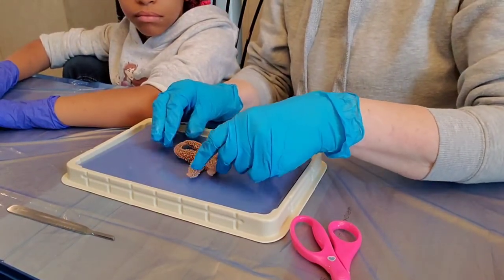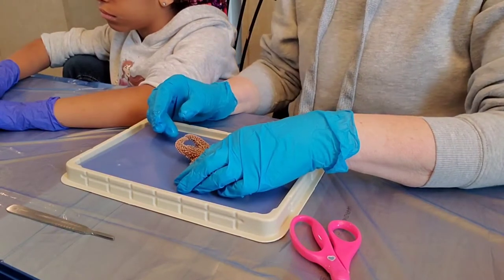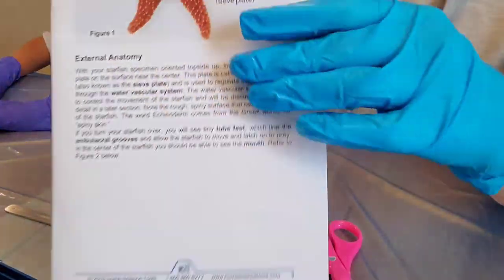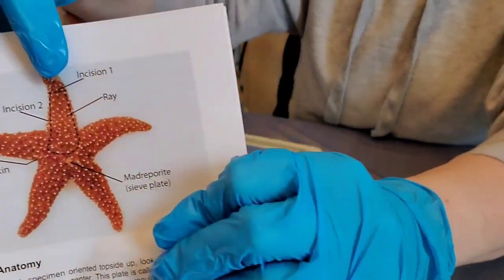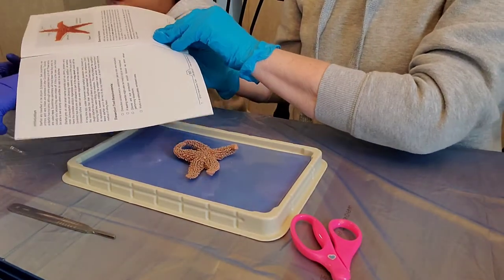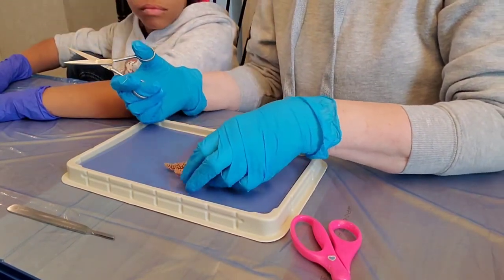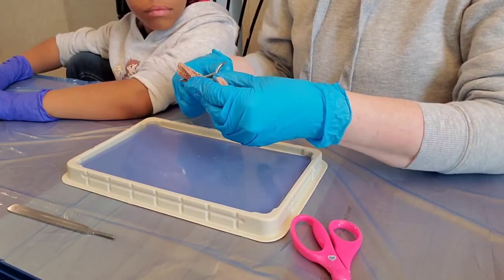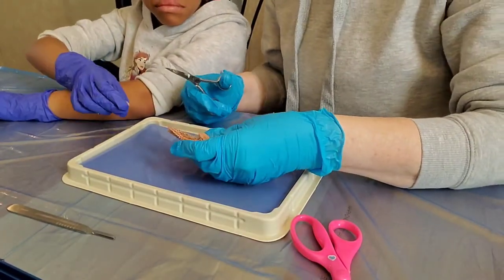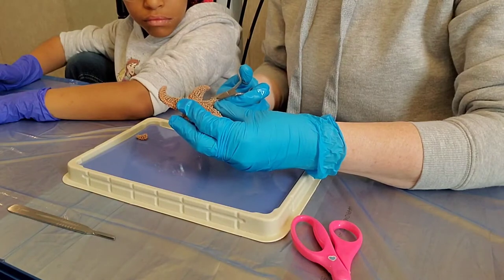All right, removing the skin. Take your scissors and remove a small piece of the tip of one of the rays. Here's the ray — the instructions show incision one and incision two right here at the top. We're going to use scissors for this. Choose a ray that does not attach the main body near the sieve plate.